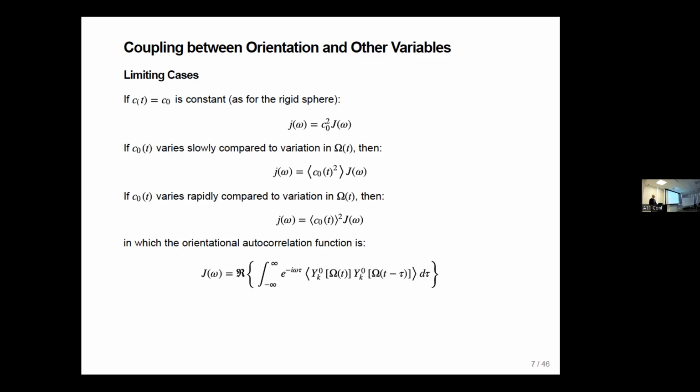And inside various structure calculation programs, this is an option you could turn on: 1 over R to the 6th averaging for ortho and para positions in phenylalanines and tyrosines, for example.